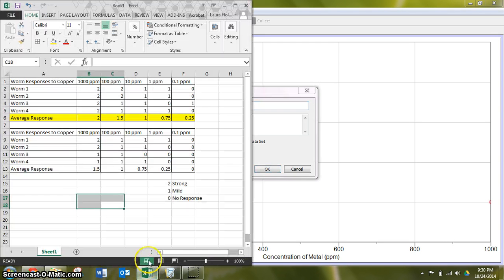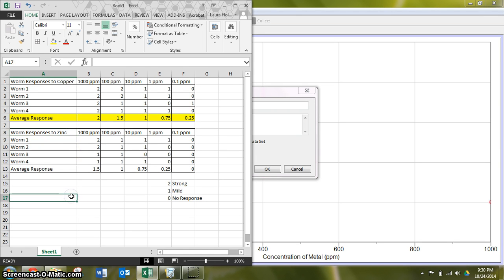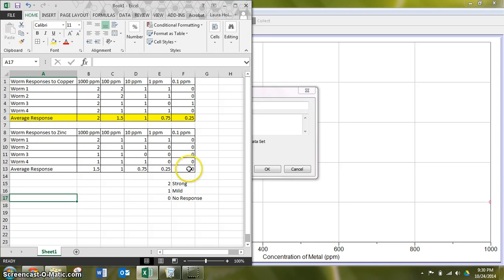Okay, I think when I copied this, I did not relabel this correctly. So we have 1.5, 1, 0.75, 0.25, and 0.